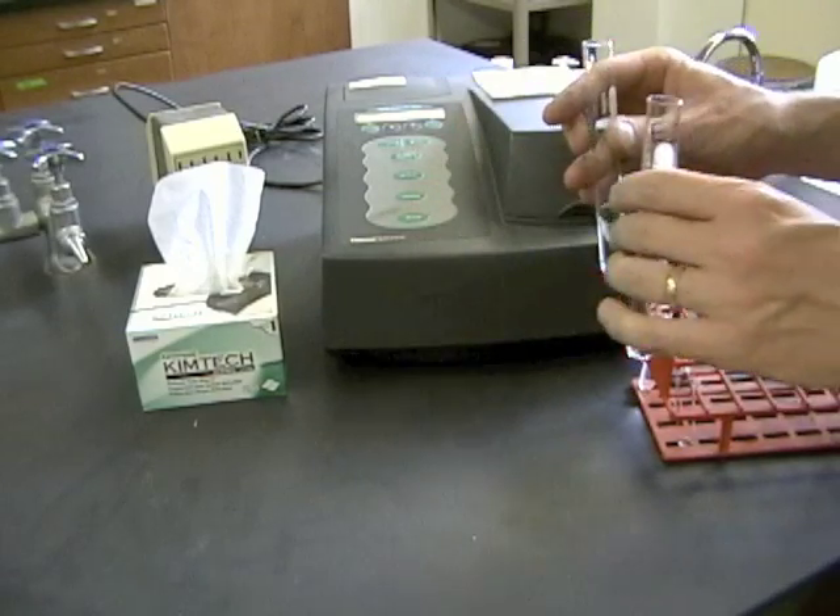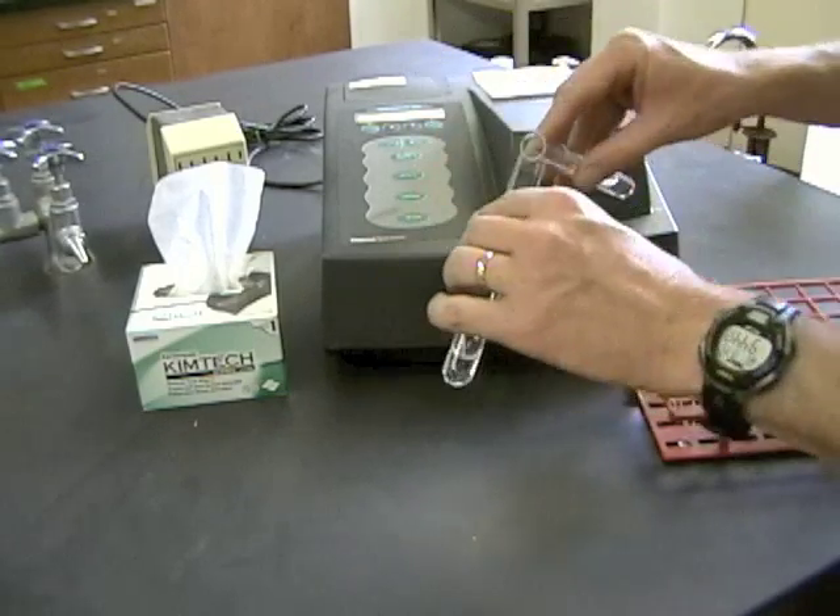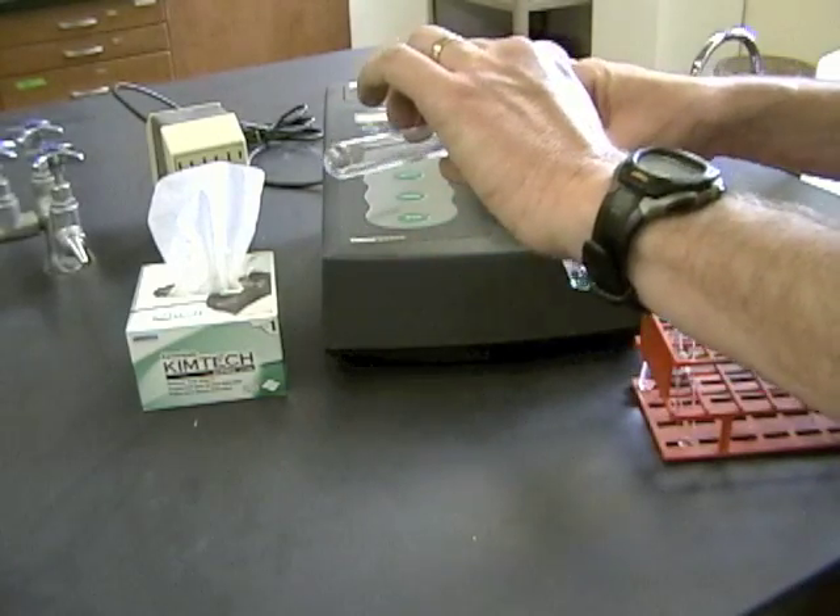As soon as I mix these together, somebody else in my group needs to start watching the clock because we're going to take readings every 20 seconds. So here I go. I'm going to mix them together by just pouring them back and forth in these big tubes.